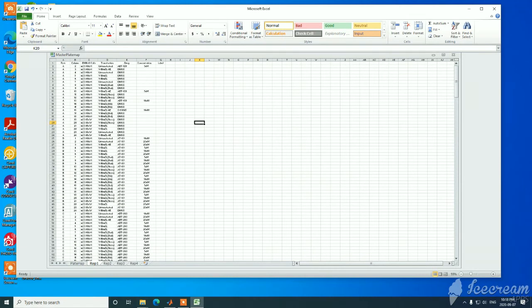And we also need to designate our treatment for DMSO wells. They need to be clearly labeled DMSO. Those are our controls for the positive and negative controls, which will be treated with DMSO only.